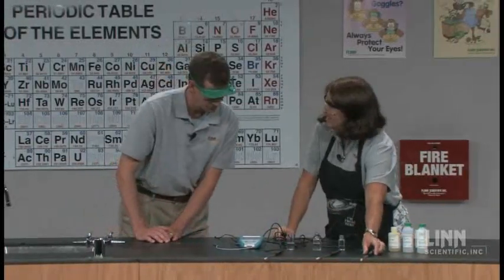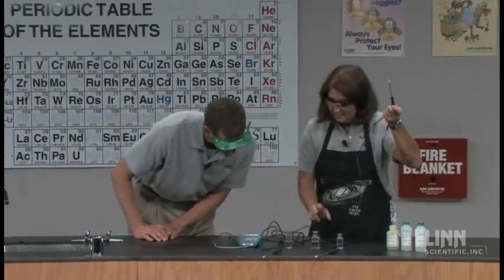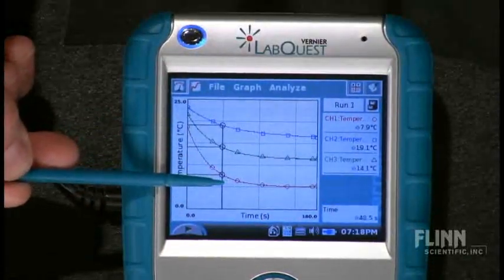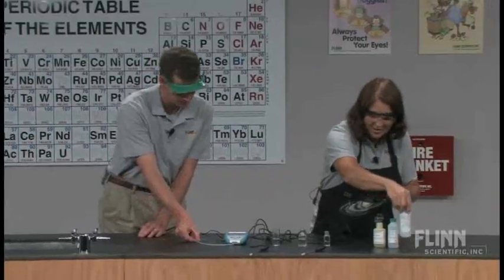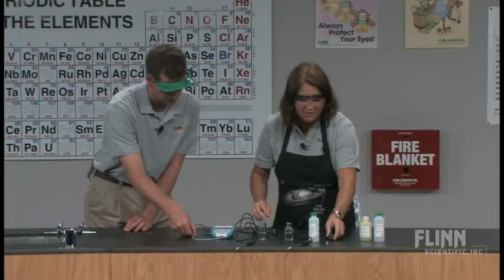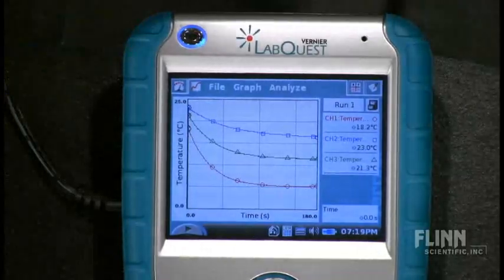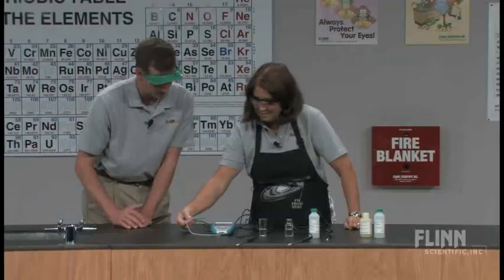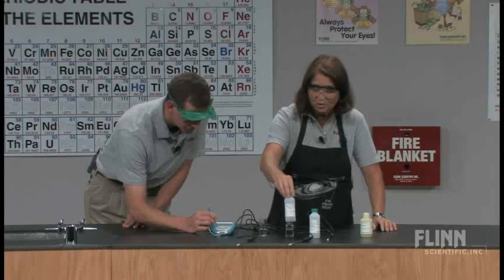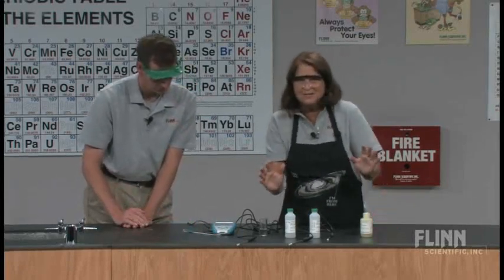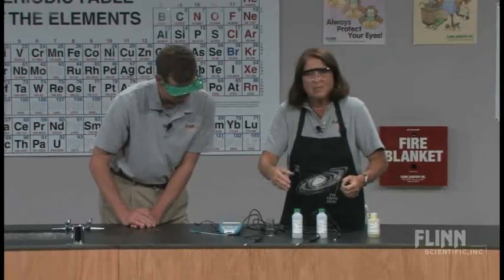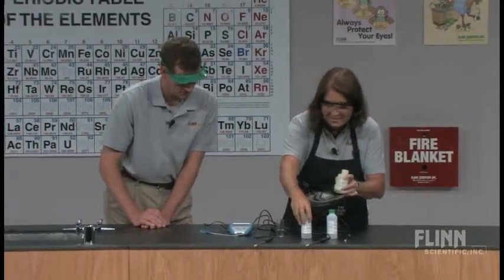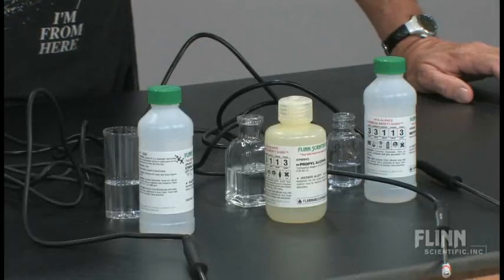Looking at the screen: channel one is the very bottom graph — that is our methanol, which evaporated the most. Here's the methanol bottle. Channel two would be the orange one — that is the top graph with the squared data points, which is our propyl alcohol. I didn't want to put them out in order; I wanted to be forced to match up the graphed data with what we have in the vials. And our last one is our ethyl alcohol, which corresponds to the middle graph.